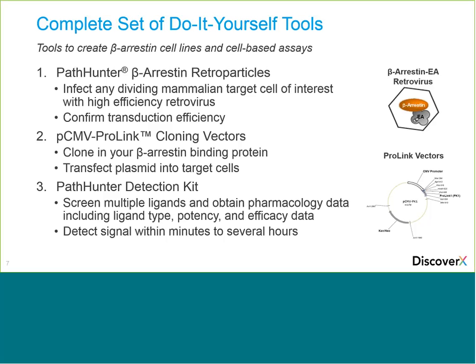Overall, if you look at the picture at the bottom, the protocol is an add, mix, and read protocol, so very simple. It's dye-free, non-radioactive, homogeneous, meaning no wash. All right, so let's move into the experimental design and review the protocols and workflow that you may use to create your cell lines and cell-based assays.